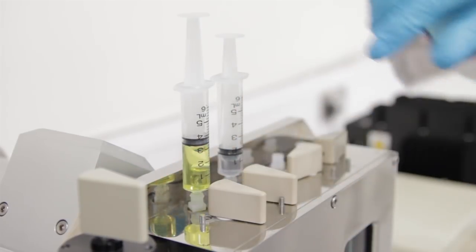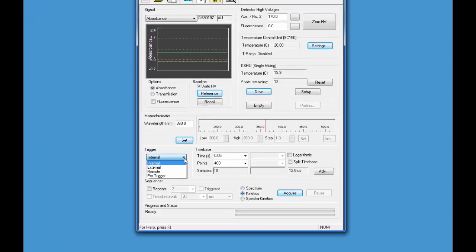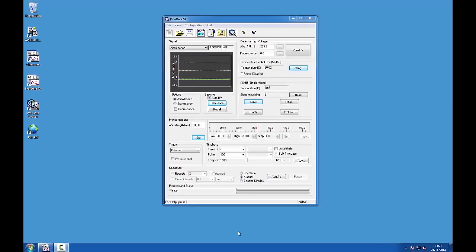On the spectrometer control panel, make sure that kinetics is selected in the sequencer and select external from the list in the trigger panel to activate the stop-flow operation. On the time base panel, choose an appropriate acquisition time based on the expected timescale of the reaction.